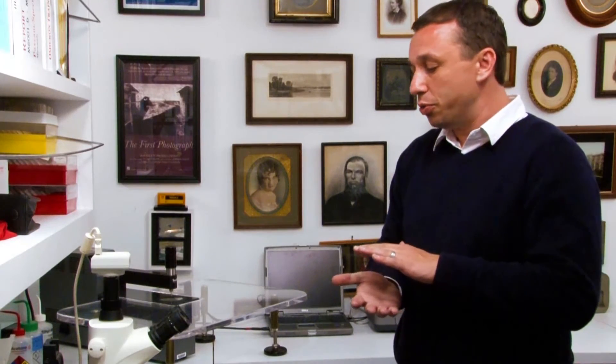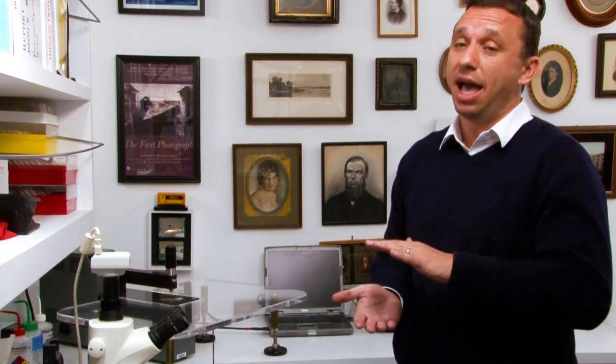In this kind of process there's no separation of the image from the substrate. In fact it's sitting directly on the paper base, and because of this being a platinum image and how stable platinum is as an element, really what's going to deteriorate here first is the paper itself and not the actual image.